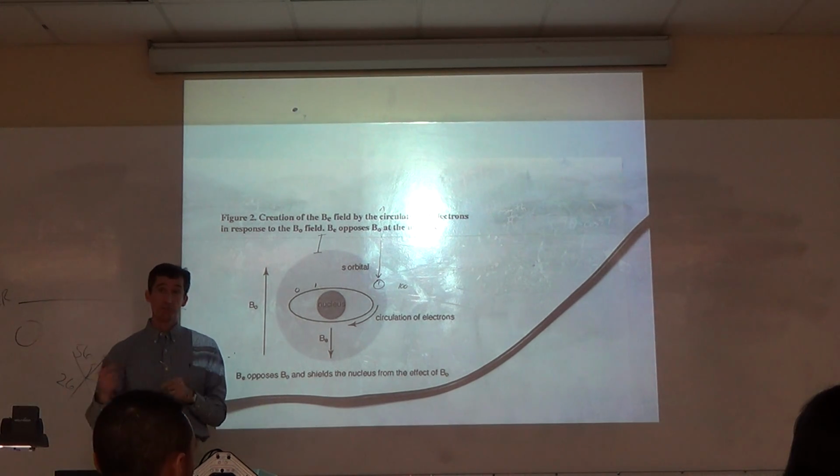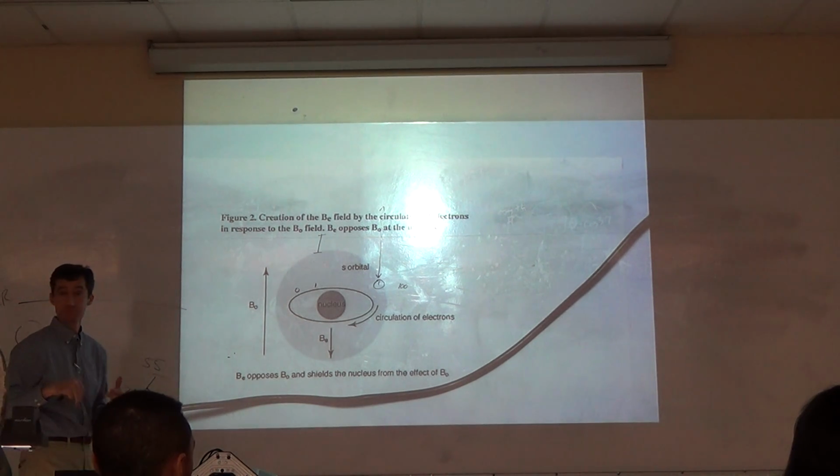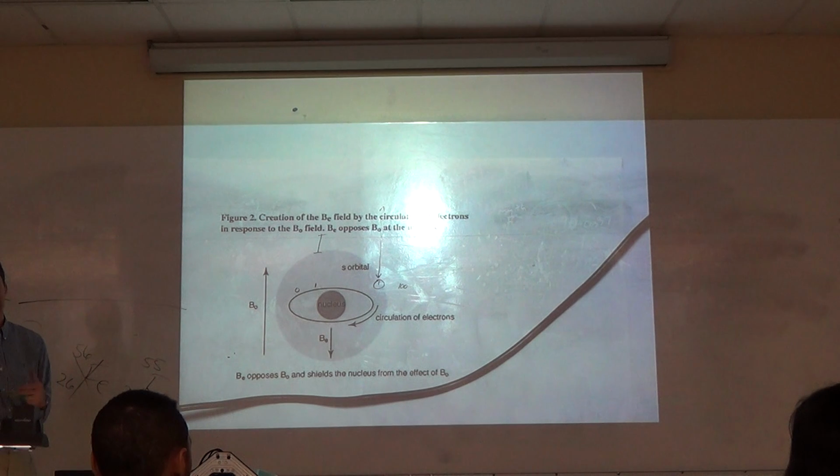Doesn't Lenz's law say an induced magnetic field will oppose the one that originally induced it? Yeah. Something like that? You just smiled and threw me off. Well, the reason I smile is because I act like I knew it forever. I've only recently kind of tried to learn more of this physics.